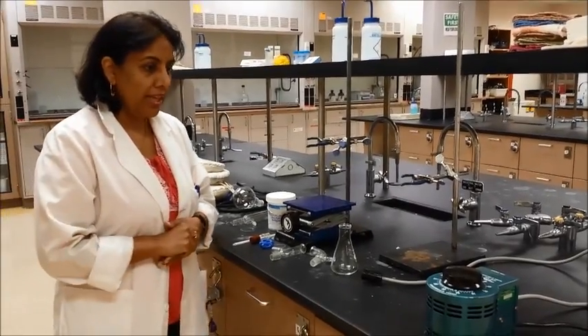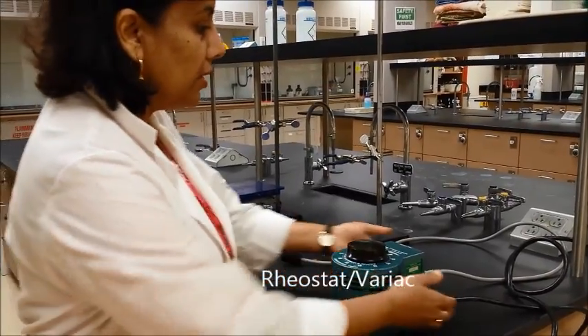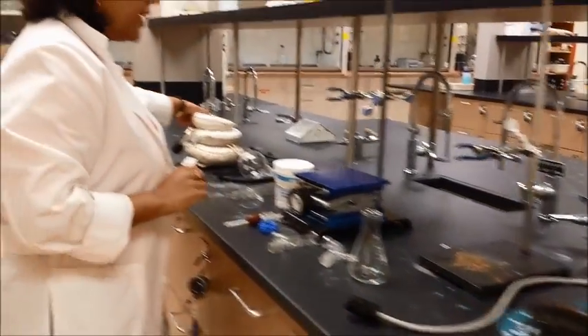A few things that you need is a rheostat, which is also called a variac. This is going to have two wires — one that actually goes to the plug and the other one that connects to what we call a heating mantle.